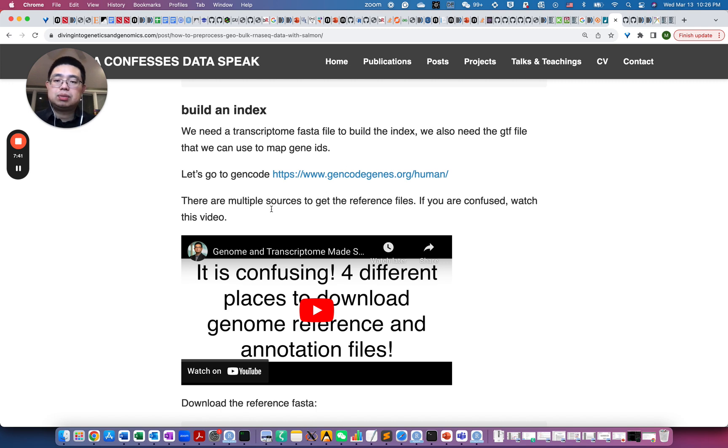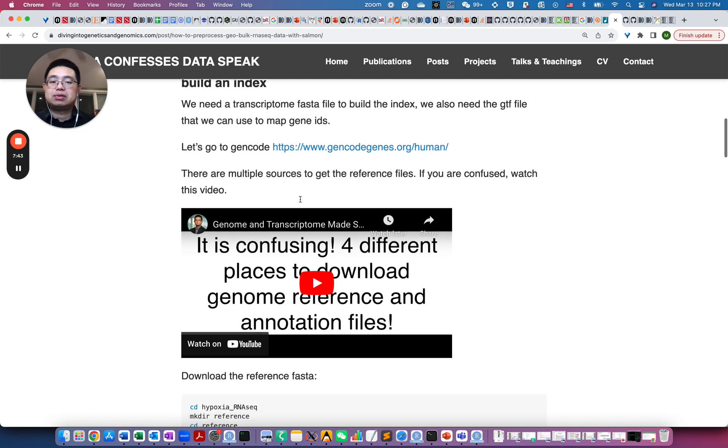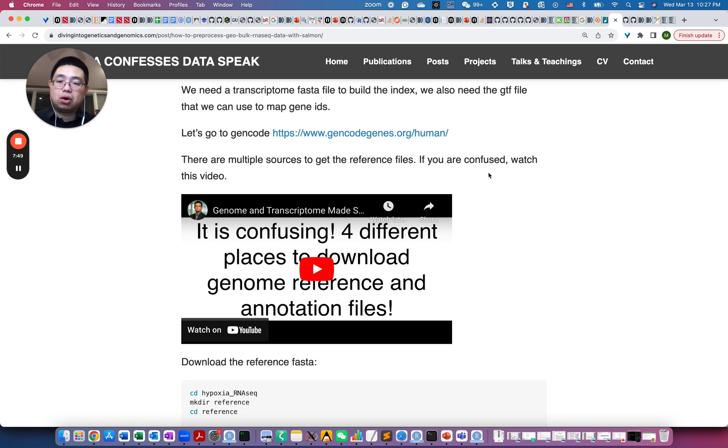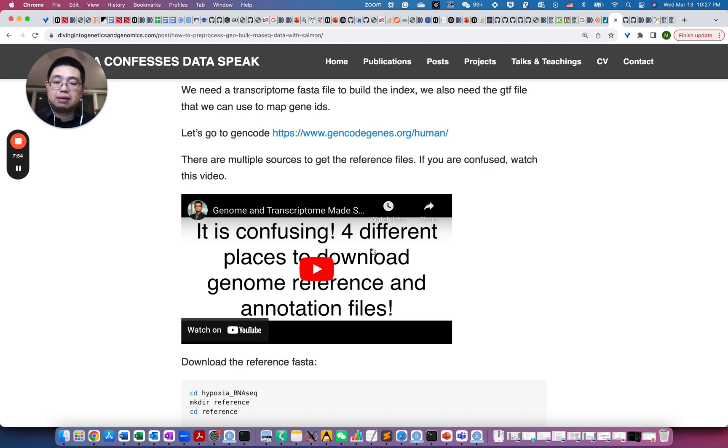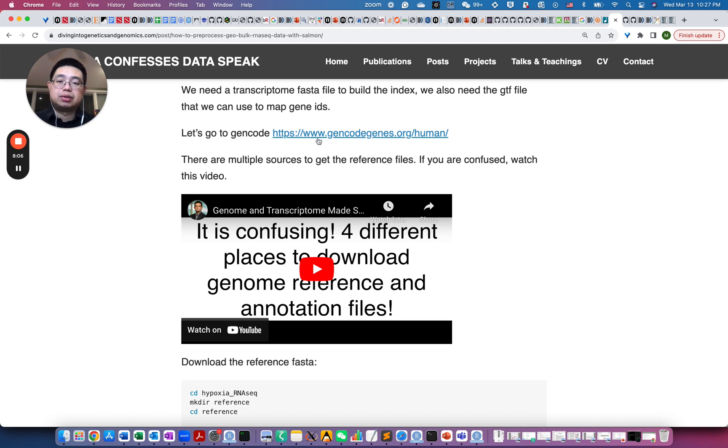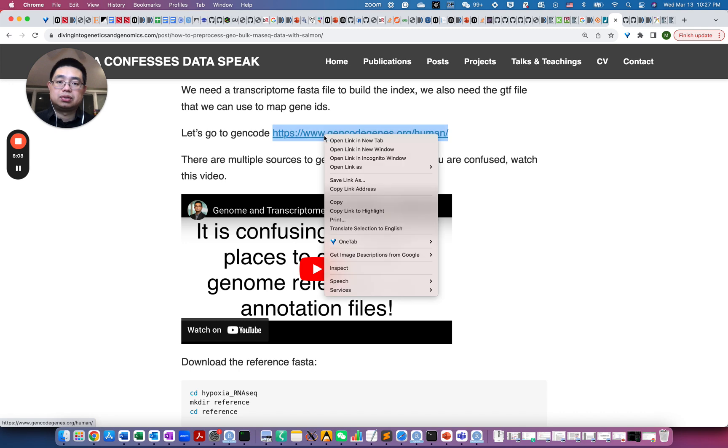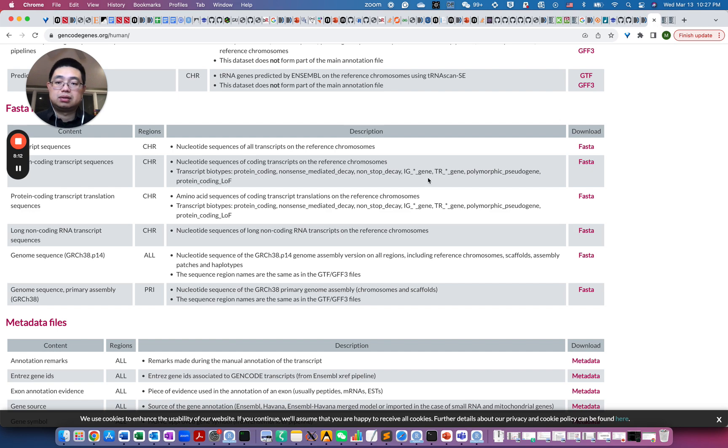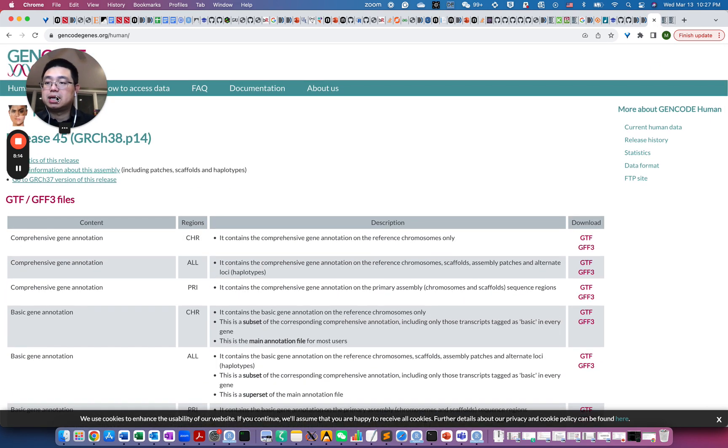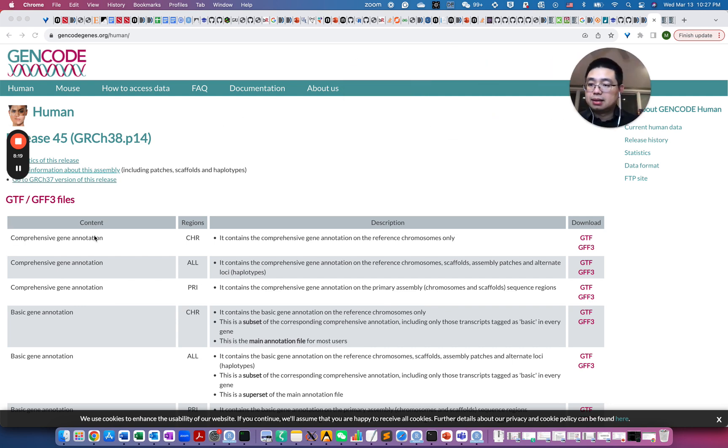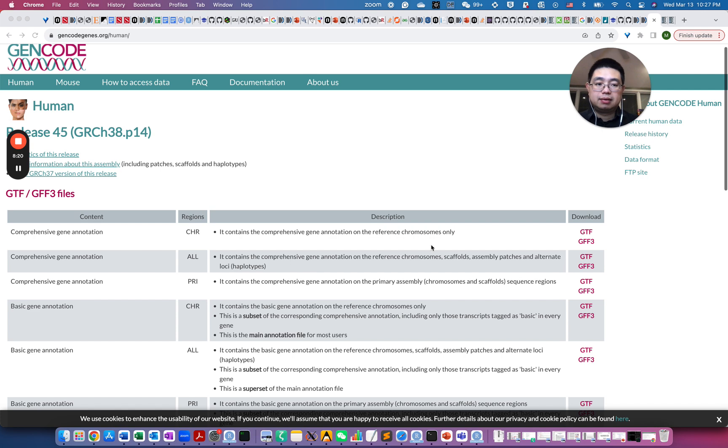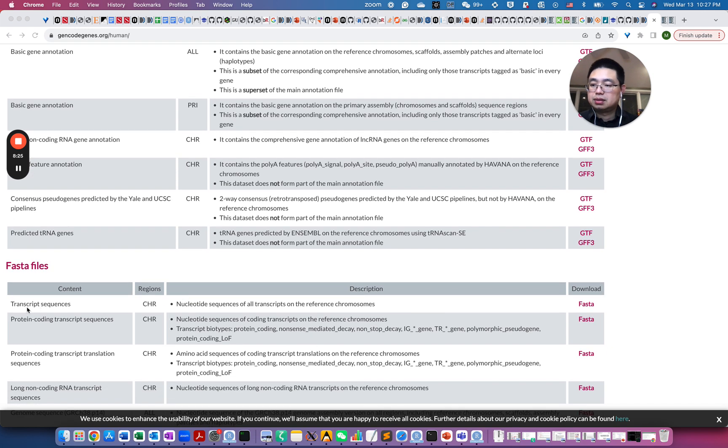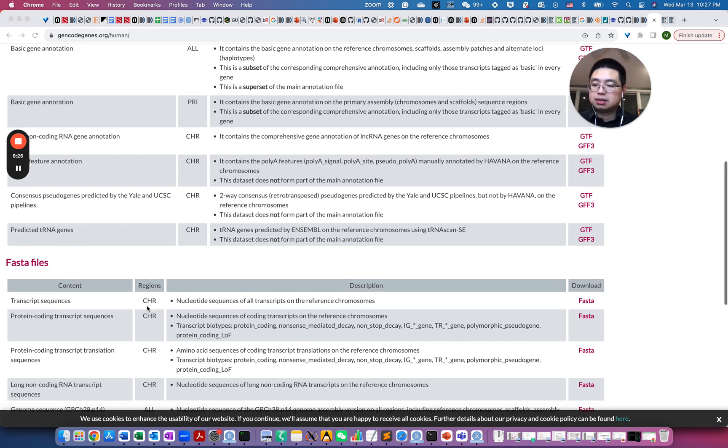So there are multiple external resources to get the reference files. So for example, there could be UCSC, Ensembl, Gencode, and there's just many places to get the reference file. So in this video, I actually show you where can you actually download those files. So for the purpose of this tutorial, we will just use the files from Gencode. So if you click that link, then it will go to this page. So essentially those GTF files and also FASTA files that we need.